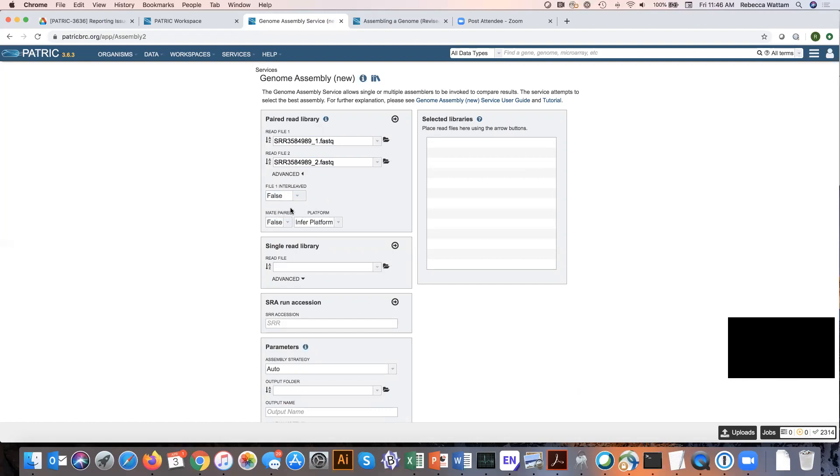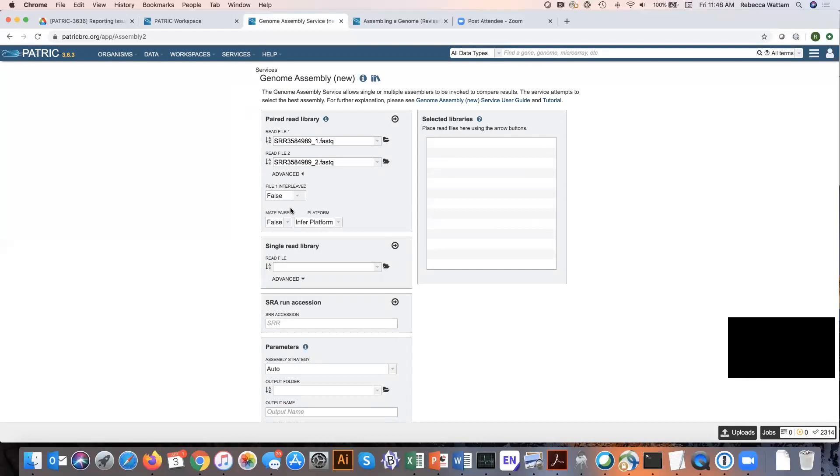Mate paired is something that also doesn't happen very often. It's a specific type of library that allows you to have your pairs much farther apart. This can be more informative than the standard paired end protocol, and they're generally bigger. But it's very rare. So if you do have this mate paired library preparation, you would click here and do true.